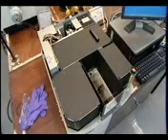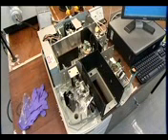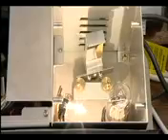Inside a UV visible spectrometer, there are usually two light sources, one giving out visible light and one ultraviolet. This one is a tungsten lamp, like a car headlamp bulb, for the visible region, and this deuterium lamp gives out ultraviolet. This mirror directs light from the appropriate source into the monochromator. This contains a diffraction grating that acts rather like the playing surface of a CD to split the light into its constituent wavelengths.